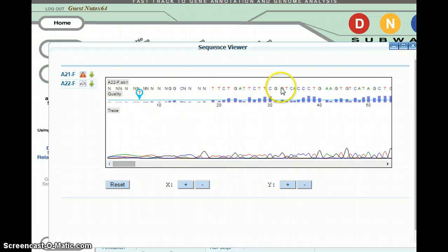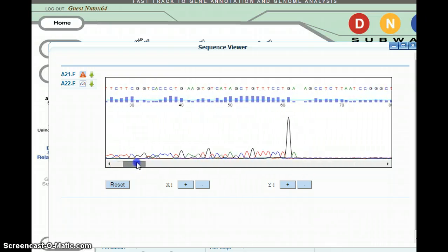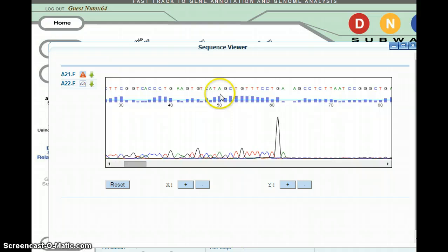This first row is your DNA sequence. This second row, where you see a light blue horizontal line, and you see the bars, is called your Phred score. If you scroll all the way to the right, you'll see that there's a Phred score associated with each base. Underneath this C, you'll see this Phred score. Underneath this T, you'll see this Phred score. In order to understand what the Phred score is, make sure to read about it in the DNA word glossary.